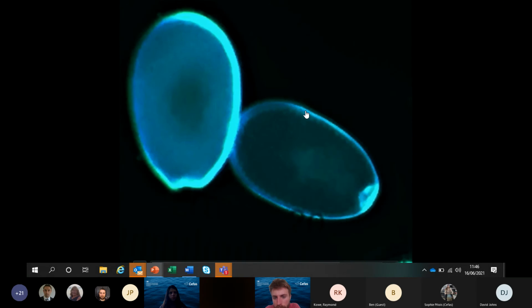So I don't know if you can make these out on the video, but there are very, very small little light spots all around the edge. So you've got these, and then you have much smaller ones going in towards the center of the cell. And it's from the pattern of those pores that you can then identify whether or not it's the species you're looking at, which is particularly useful if it could be toxic.